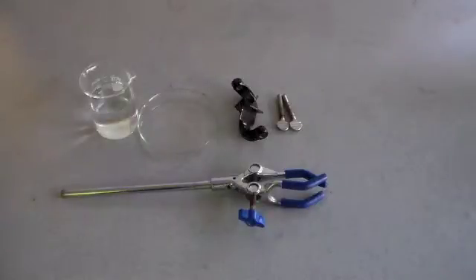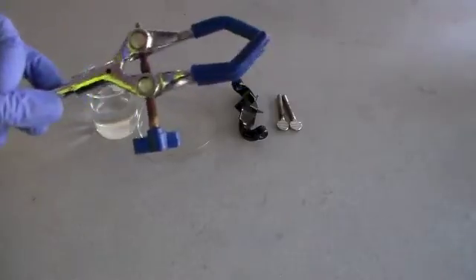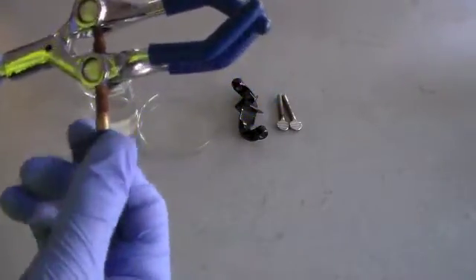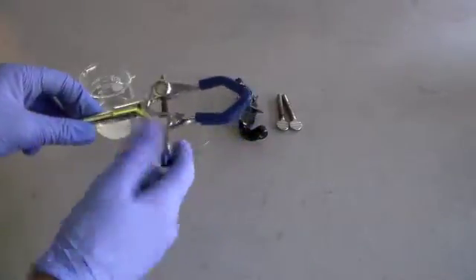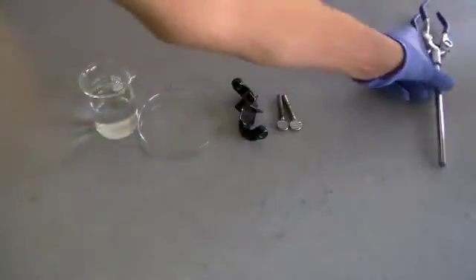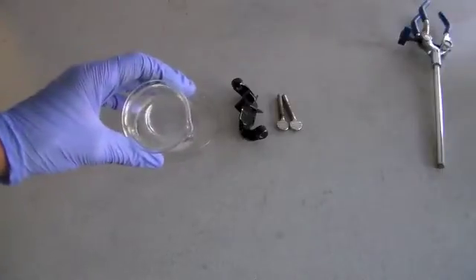Hey guys and welcome to The Shack. Today I'm testing different ways of removing rust from different ring stand clamps. You can see there's quite a bit of rust on this joint here. Normally it's not much of a problem, but eventually these can rust so much that they're difficult to turn, and that can be a problem. So today I'm going to test vinegar and table salt.